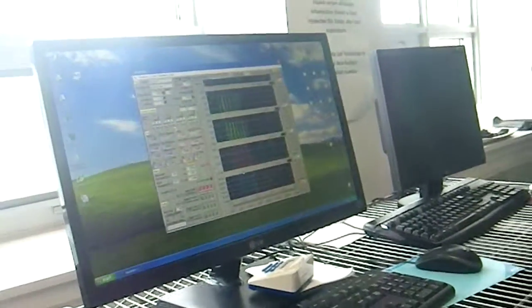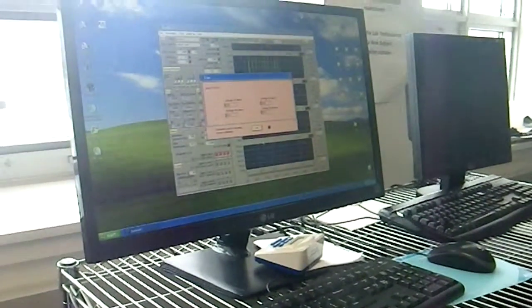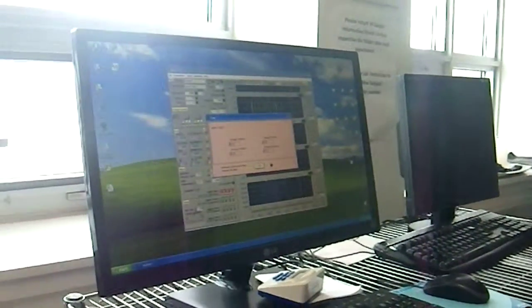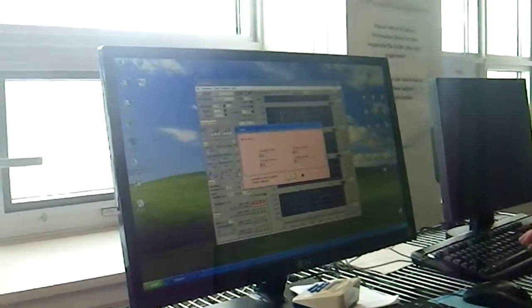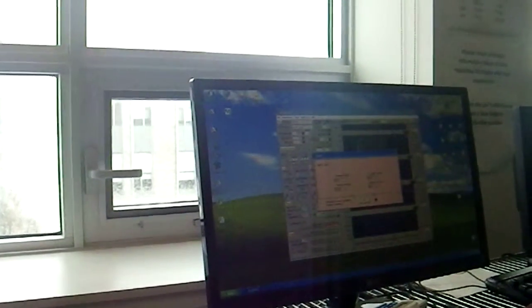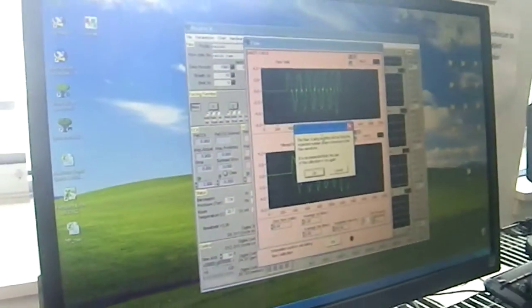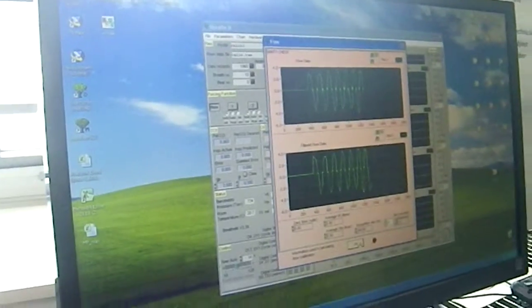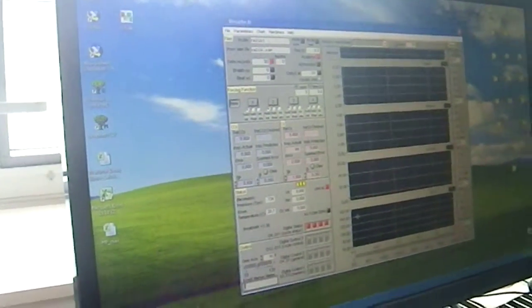And you want to make sure you do this at different velocities. That way the computer gets an idea of the flow, different flow rates, and it will have a correct measurement altogether. So you hit OK. This light here is still dark. It always is the first time, so we hit OK. It'll ask you to do it again. So hit OK, and then OK down here, and then redo it.